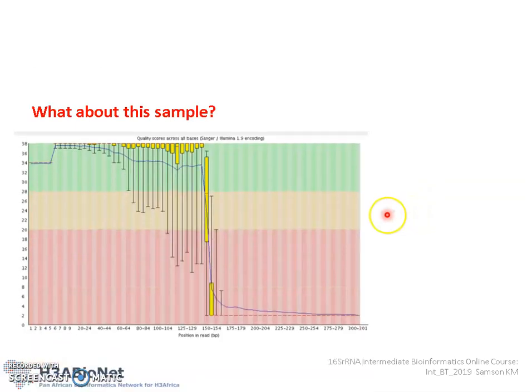What would you say if you find maybe this is your raw sequence data? You see here the sequence was 301 length, but you see the quality from the beginning was of good quality, but around 50% of it, the quality is below 20. So this quality is very bad. You cannot get anything out of this even if you process with the high throughput tools. For that matter, you must figure out if really it's worth going on working with that kind of data. If it were me, I would straight away reject this kind of sample because the quality is very poor and I don't expect to get anything good out of it.